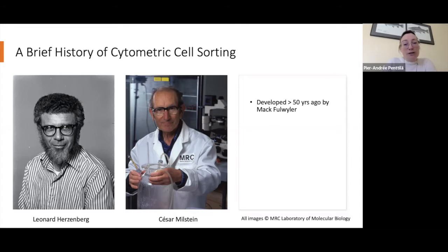He became interested in the Coulter counter, which, as I mentioned previously, was developed by Walter Coulter. The Coulter counter enumerates and sizes particles suspended in electrolytes. These particles are pulled through a small glass tube concurrent with an electric current and produce a change in impedance that is proportional to the volume of the particle traversing the orifice. This pulse in impedance originates from the displacement of electrolyte caused by the particle and was being used in hematology to count and size the various cells making up whole blood.